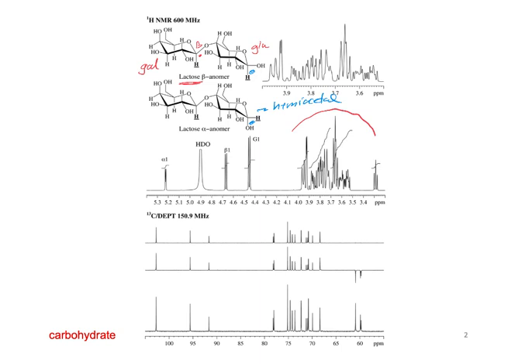And so because of that, they can open and close. You end up with a mixture of, this is the beta anomeric position here, and this one has the alcohol going down, and so this is the alpha. So it's actually a mixture of two compounds.